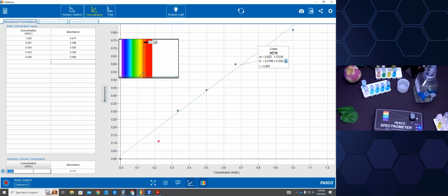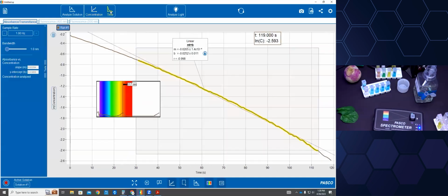But if I get in the ballpark, I get that brownish box. And if I'm just right, within 5% error, I get the green as go light.